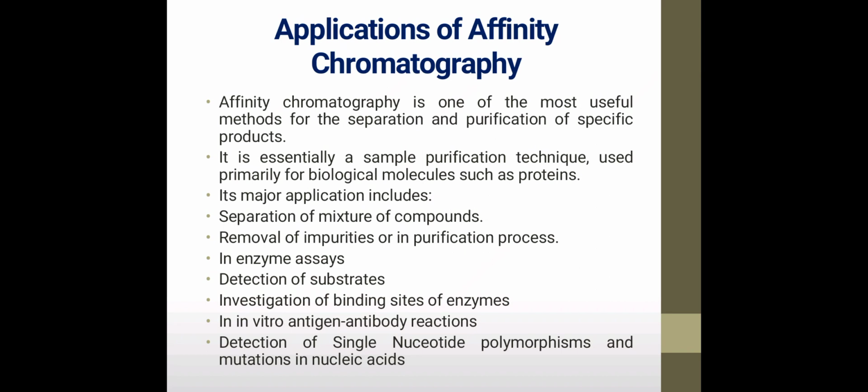Then it is essentially a sample purification technique used primarily for biological samples such as proteins. So whenever we want to separate and purify the protein mixture, you can carry out this process. So you can bring about the purification of these protein molecules, etc.